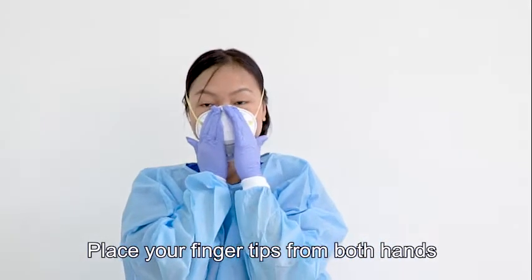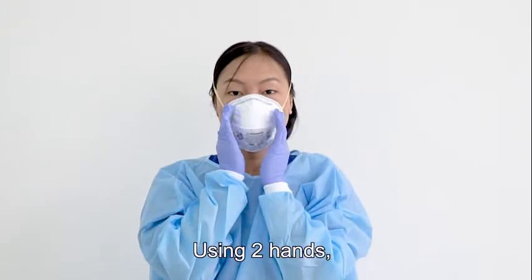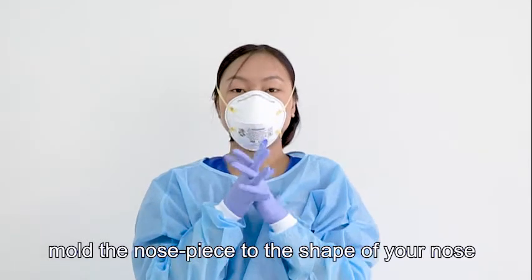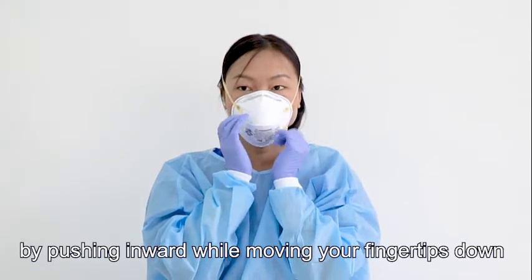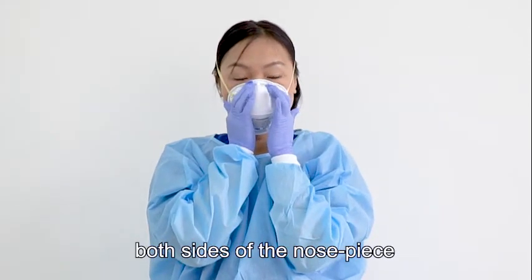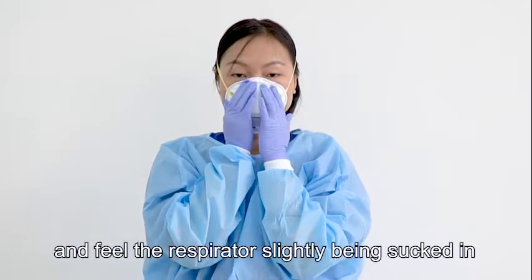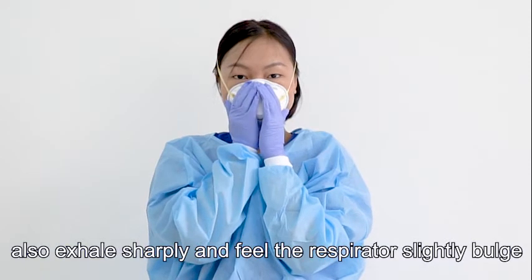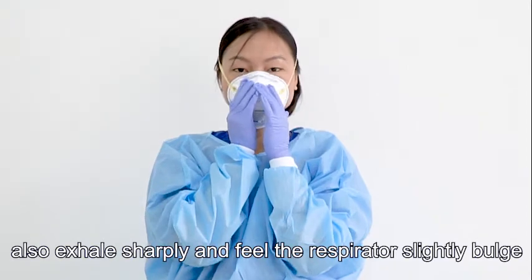Place your fingertips from both hands at the top of the metal nose piece. Using 2 hands, mold the nose piece to the shape of your nose by pushing inward while moving your fingertips down both sides of the nose piece. Perform seal check by inhaling deeply and feel the respirator slightly being sucked in. Also, exhale sharply and feel the respirator slightly bulge.